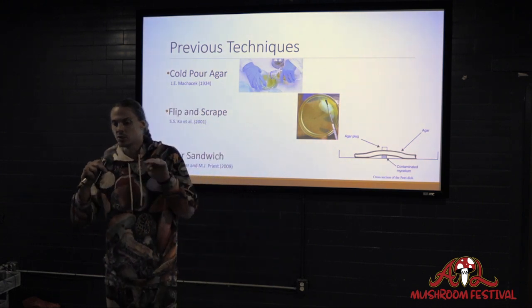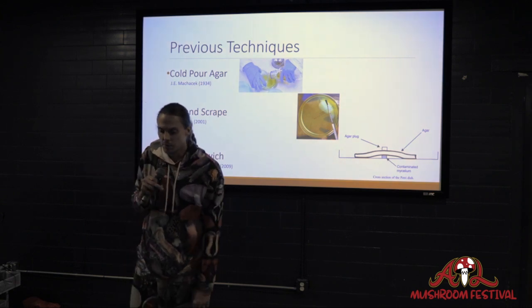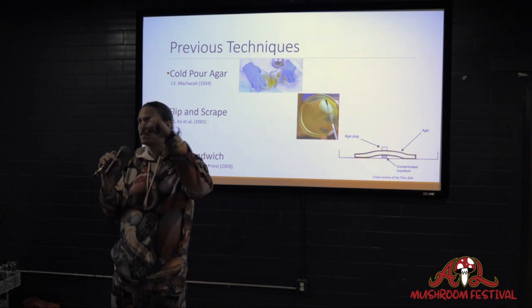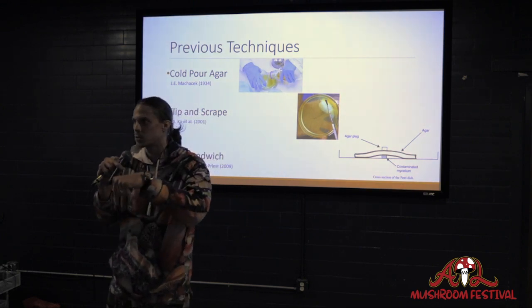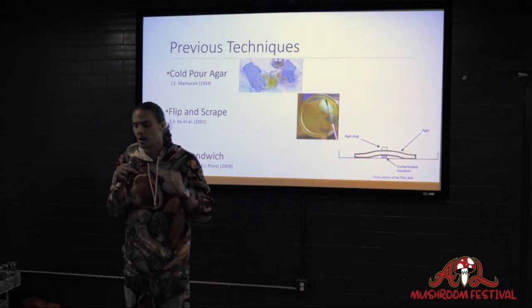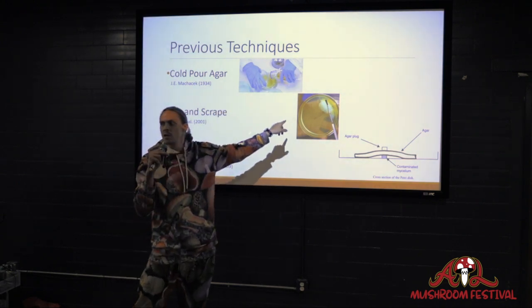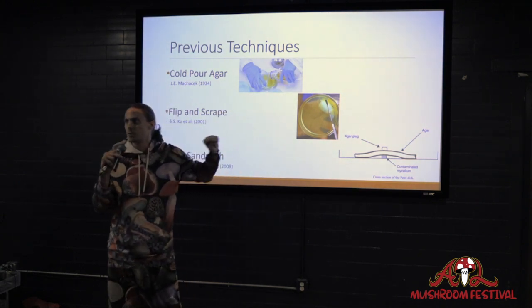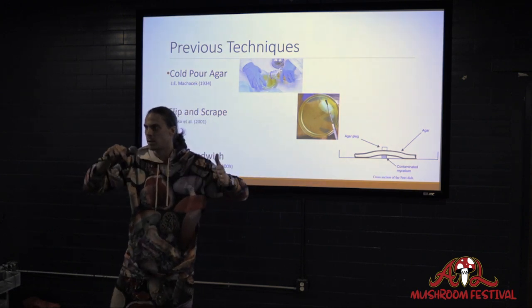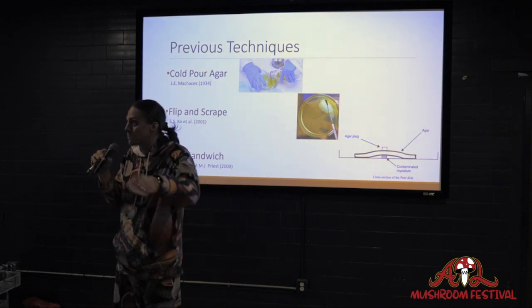But the bacteria doesn't grow through things; it grows on the surface of things, right? I don't know of many instances where a disinfectant is having to disinfect deep inside the surface to kill some sort of bacteria that's in the table instead of on the table, right? And so with all of these properties, your culture is having to grow through the agar, and by growing through the agar, you're creating a separation, because the bacteria cannot follow through it. It can go over it, but not through it.